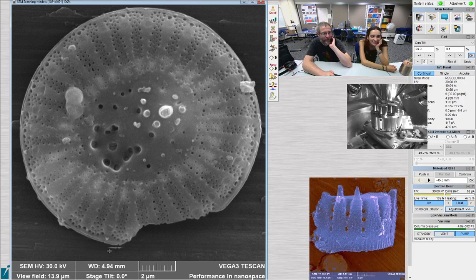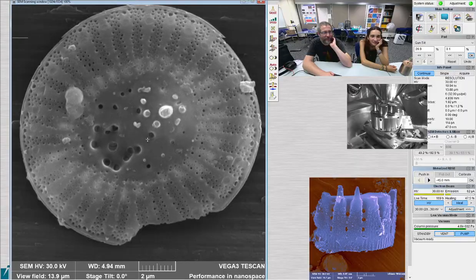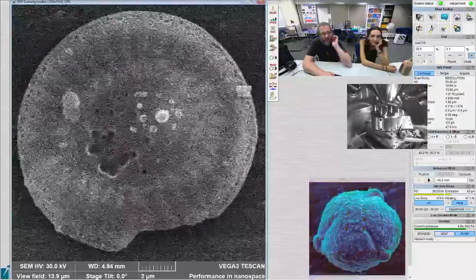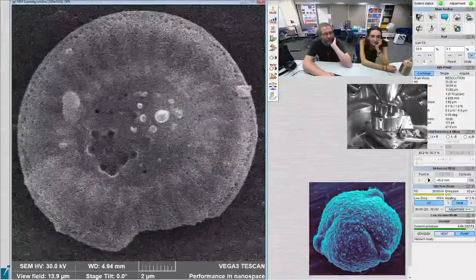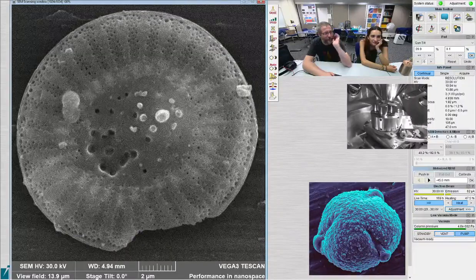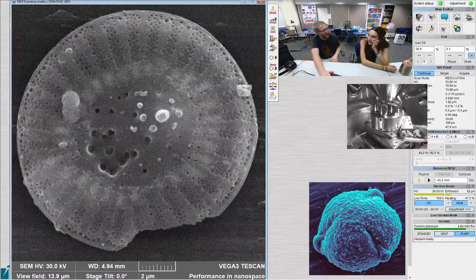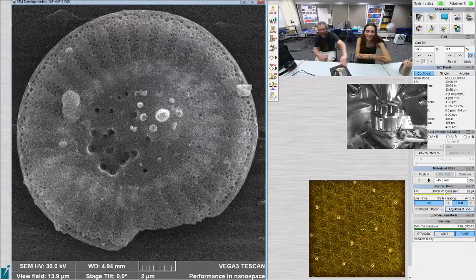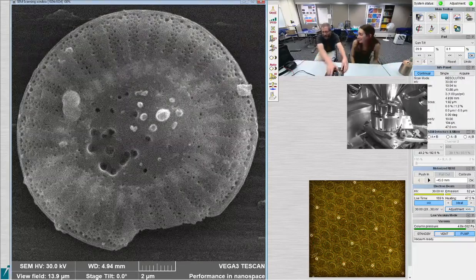Yeah, it looks like maybe it's drifting just a little bit. You can see how far it is right there. It's just a slight drift. Usually it's because the heat adjustment's not perfect. But it's going to make the diatoms stretch just a little tiny bit, so they're just a little bit wrong. All right, Laura, you're in charge. Are we doing the stigmation or not?